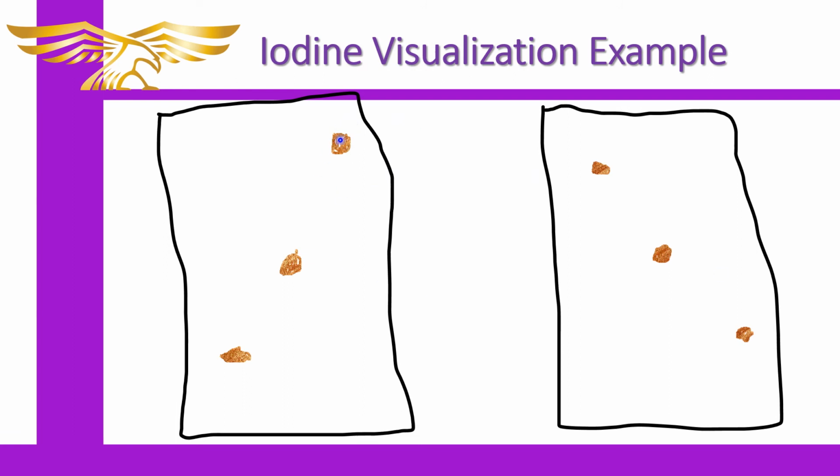Essentially, they'll look a bit like this, because iodine has kind of a dark purplish brown looking color, and they tend to look kind of a dark brown color, tan maybe. It just depends, it kind of looks like that color, and so it'll make them show up like that. And sometimes you'll get a surprise because it will make something show up as a spot that you didn't realize was there because it didn't show up on the UV for some reason.